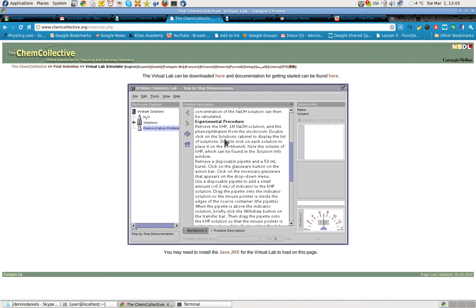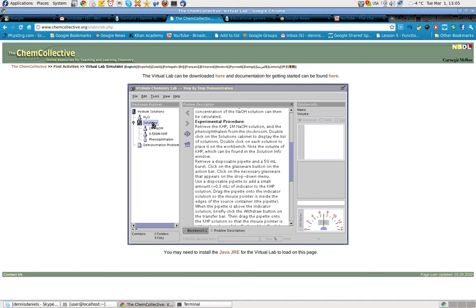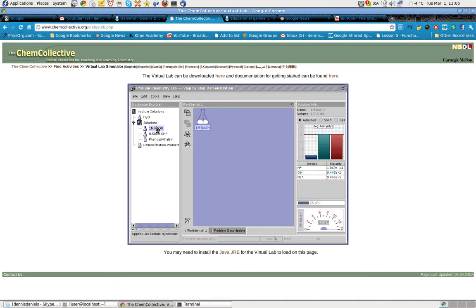Solutions means liquids. Double click on each solution to place it on the workbench. Note the volume of KHP, which can be found in the solution info window. Alright, so we double click on that. And this is sodium, oxygen, and hydrogen. Sodium hydroxide.